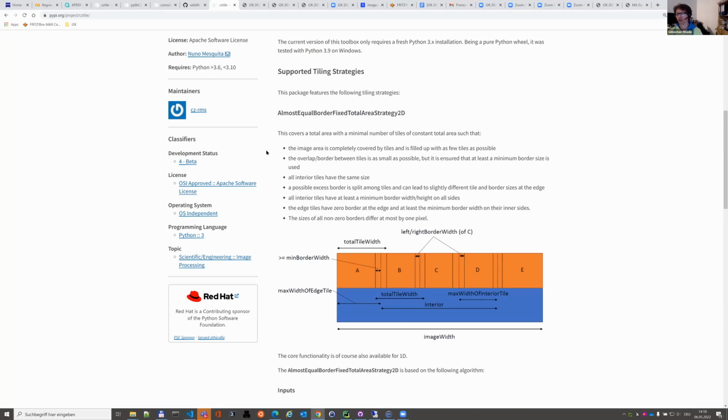Especially at Zeiss, we encounter a lot of images, not only from the bioimage community, but also images with way larger structures in them. In my opinion, the tile overlap you need for AI applications really depends on what you are actually segmenting. If you know how big your objects typically are, you have a more or less good estimate of what tiling is needed.